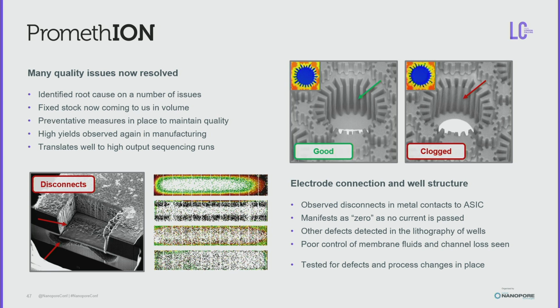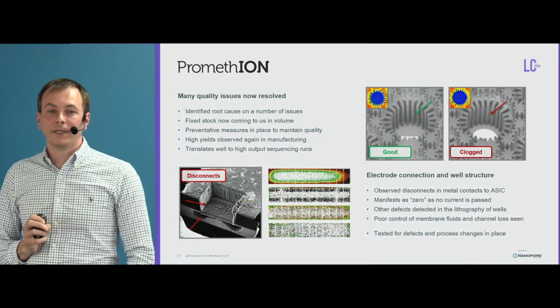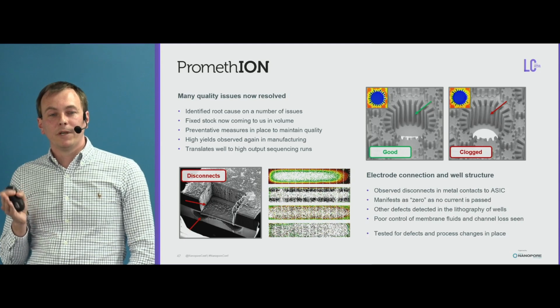And that's what we see in these chip maps. They come in all kinds of shapes and sizes. White is a good connected channel. Black is a disconnected channel. And we've got really good at detecting these. So most of these get caught in Oxford, but these kind of marginal cases might have crept through a few months ago. But thankfully now we've resolved the issue.